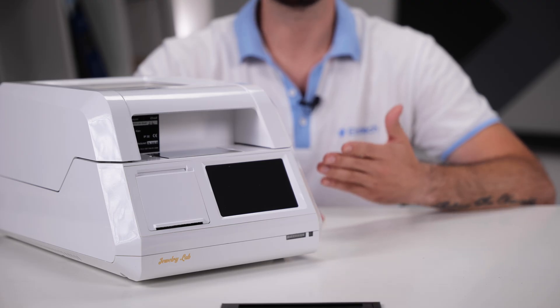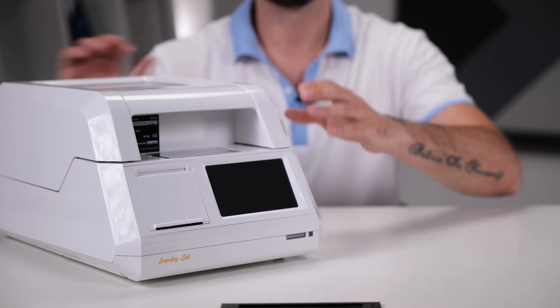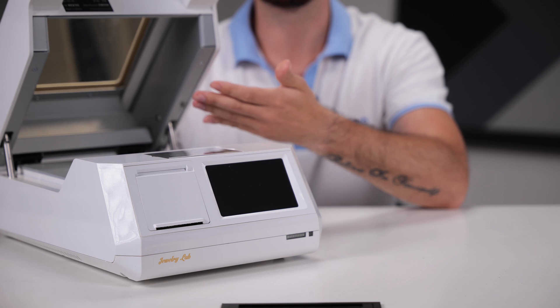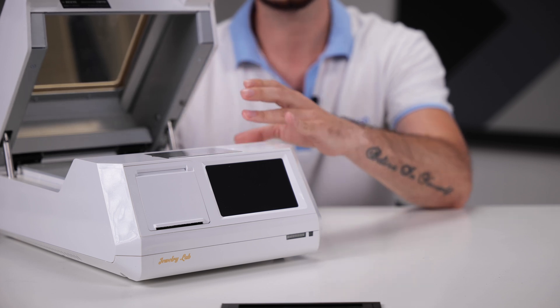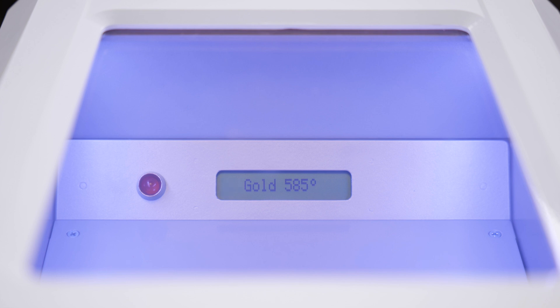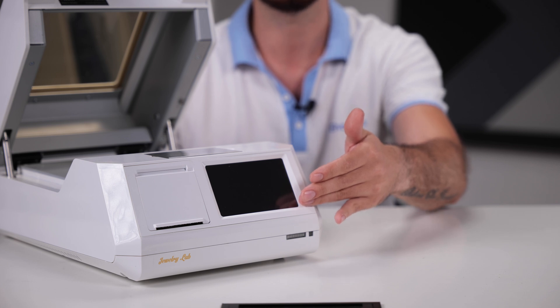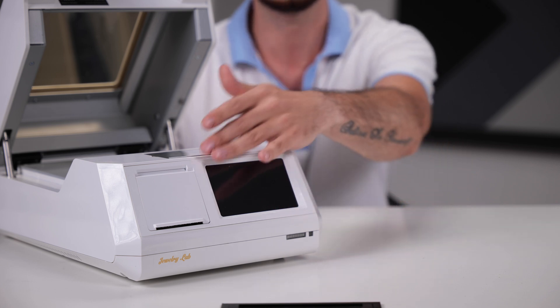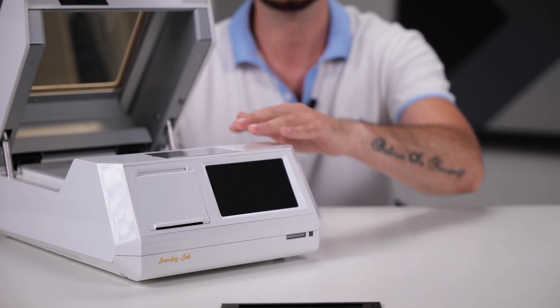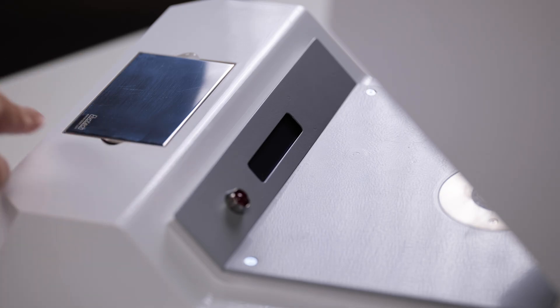Let's take a closer look at the analyzer itself. The body is made of durable plastic. Lead glass is built in to monitor the analysis process, as well as to monitor the client's display, which is located on the inside of the measuring chamber. On the front panel we have a touchscreen display and a printer for printing analysis results. We also have high-precision built-in scales that determine weight down to hundredths of a gram.